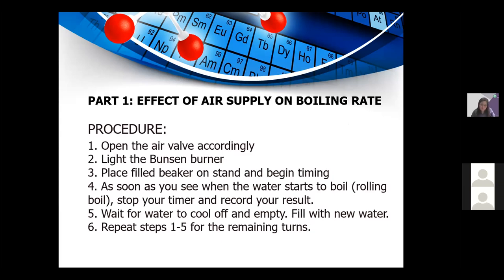Effect of air supply on boiling rate — the procedures are: Step 1, open the air valve accordingly. Step 2, light the Bunsen burner. Step 3, place the filled beaker on the stand and begin timing. Step 4, as soon as you see the water reach a rolling boil, stop the timer and record your result. Step 5, wait for water to cool, empty it and fill with new water. Step 6, repeat steps 1 to 5 for the remaining trials.